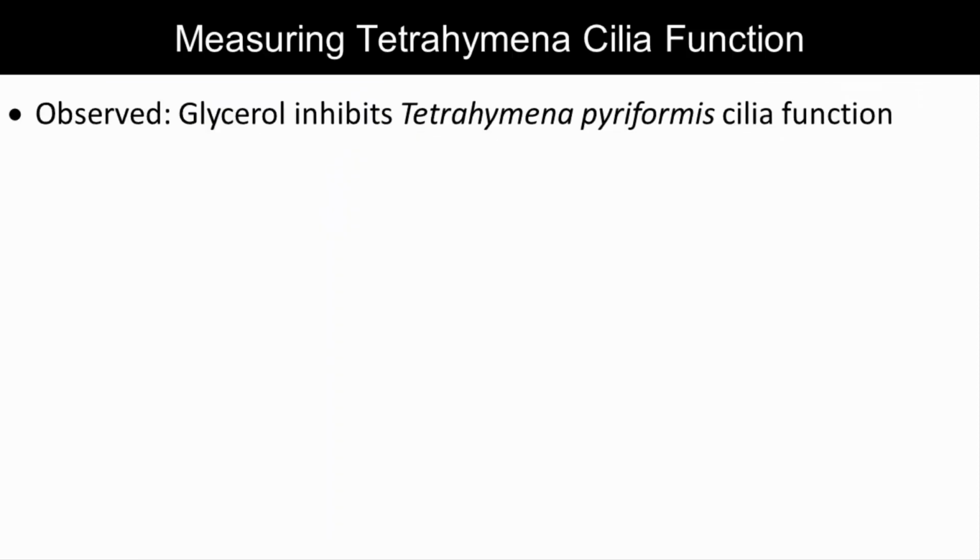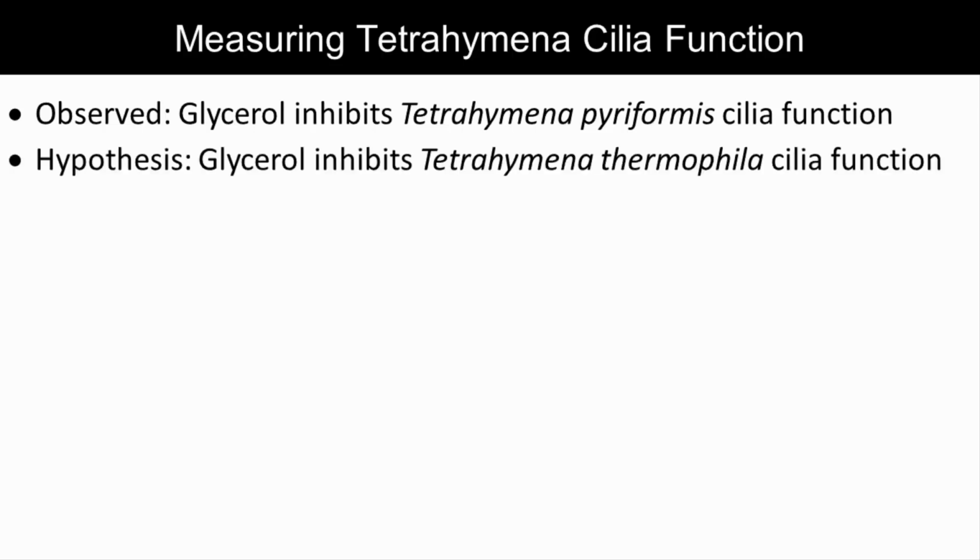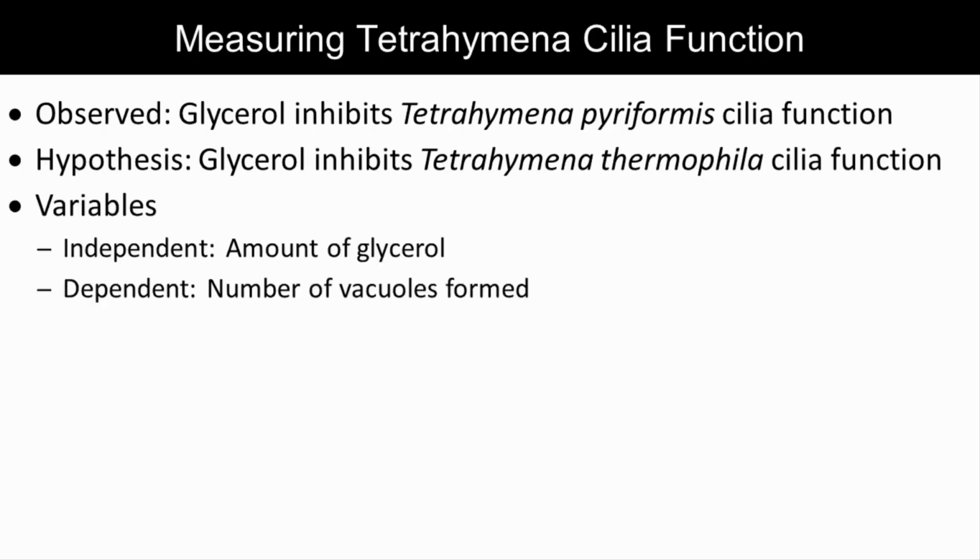I read a paper that concluded glycerol inhibits cilia function in Tetrahymena piriformis. This led me to hypothesize that glycerol negatively affects Tetrahymena thermophila cilia as well. We can set up a simple experiment to test this.